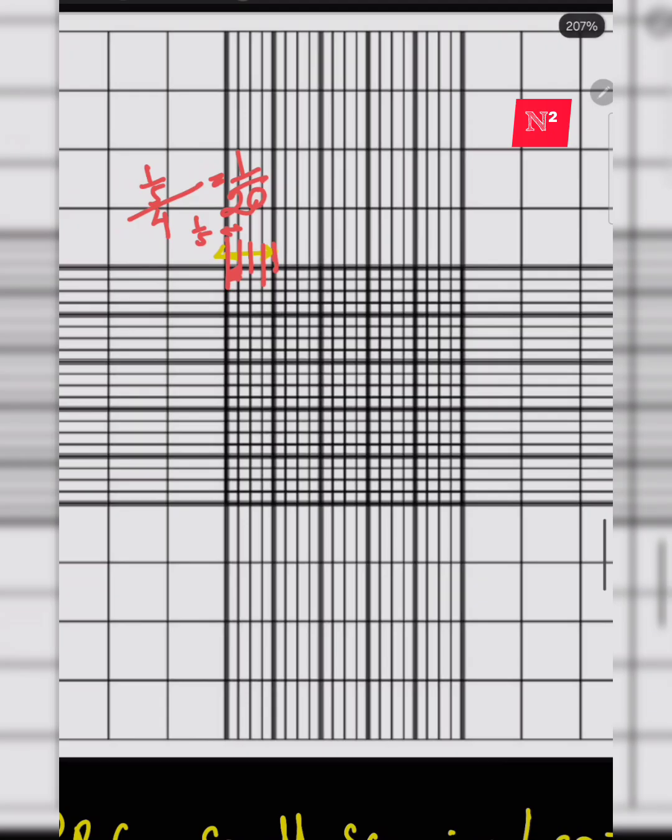Similarly, here also you can see the length of this RBC medium square we know is 1 by 5, which is divided by a single straight line into 4 equal parts.